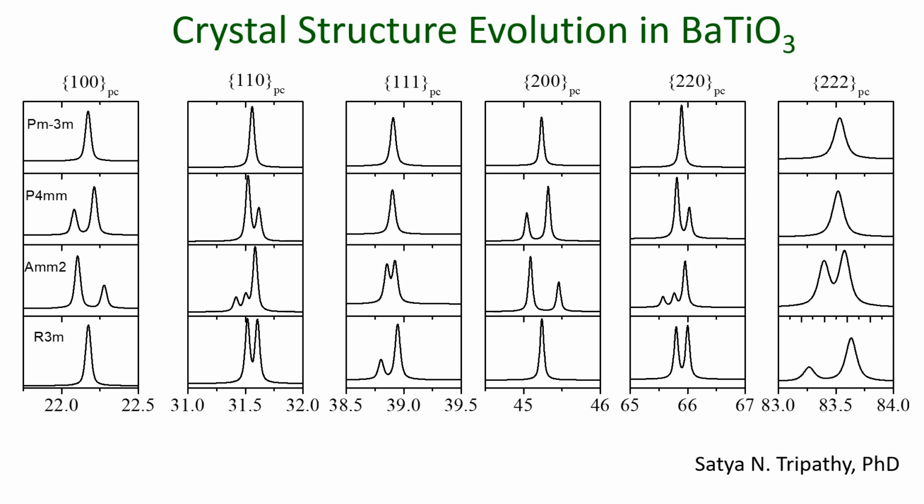If you see this data, it acts as a standard reference template to understand the crystal structure of barium titanate. Most of the time, people do not represent this data to justify the crystal symmetry, what is a doublet, what is a triplet, what is a singlet. They never specify this, just do the refinement and say that this is the space group. But the underlying mechanisms lie here. This will act as a standard template to understand the crystal structure data for barium titanate.